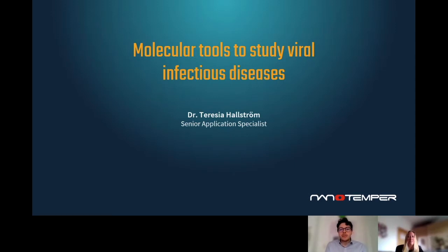Today, we would like to discuss viruses, what they are, and how understanding them can help us find new therapeutic targets. We will discuss some data extrapolated from different publications, addressing through binding affinity studies key questions like viral composition, viral inhibitor function, and viral infection mechanism. We hope this webinar will shed some light on this invisible threat and spread some knowledge about tools available to push research forward. It's my pleasure now to give the word to Tessa, who will discuss with us molecular tools to study viral infectious diseases.